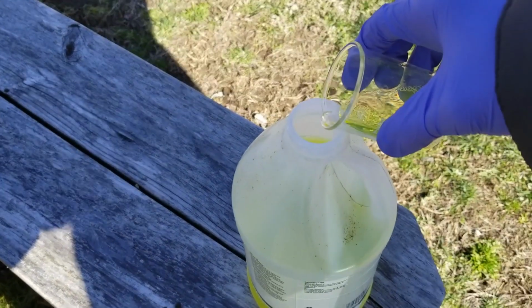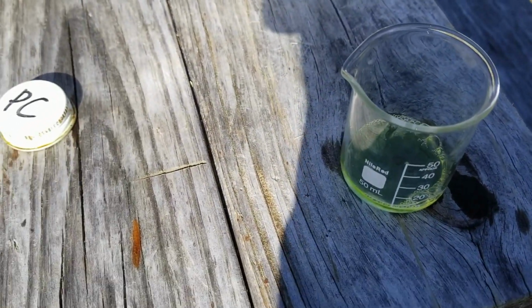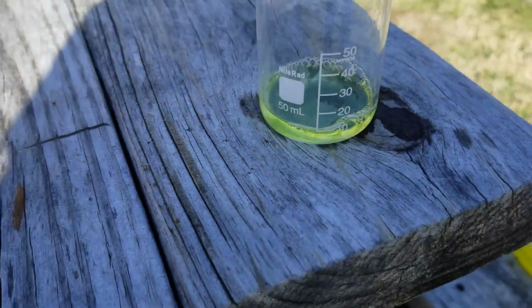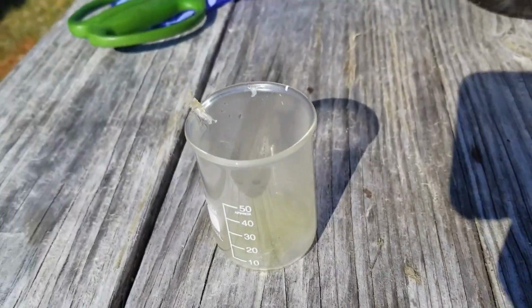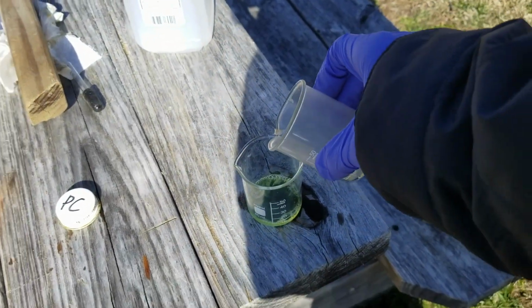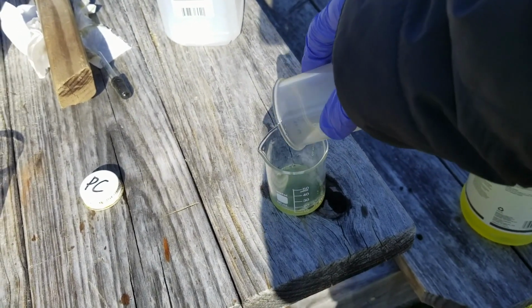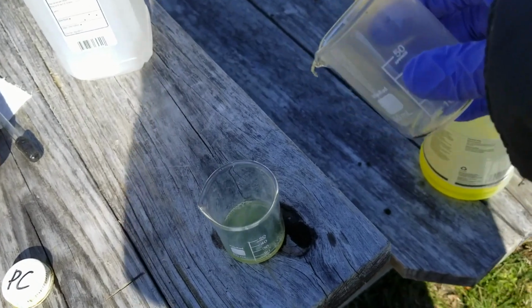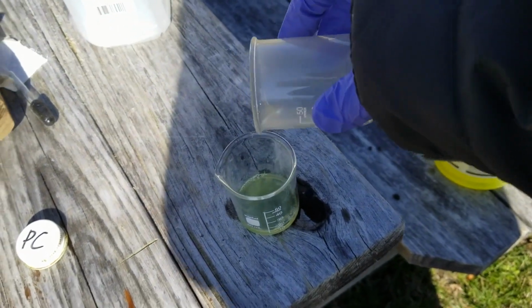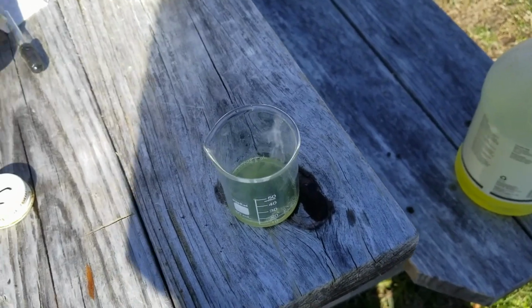I cleaned this beaker, by the way. And so, the unfortunate thing is that's yellow, and this is yellow too, but whatever. We're just gonna add this directly to the ammonia. And you can see that it's making some ammonium nitrate in the vapor phase, which I think is pretty cool.